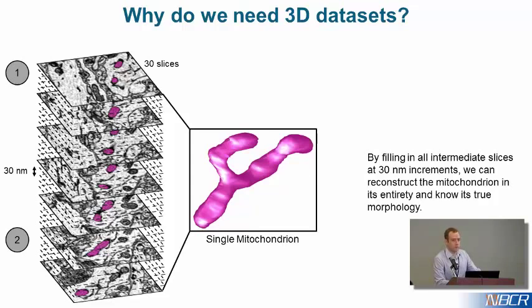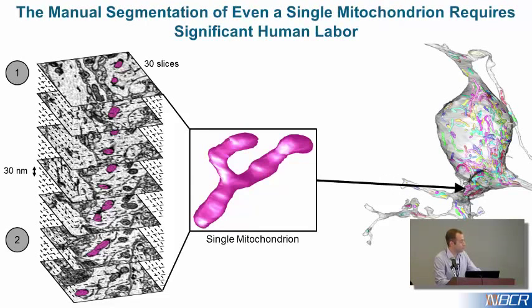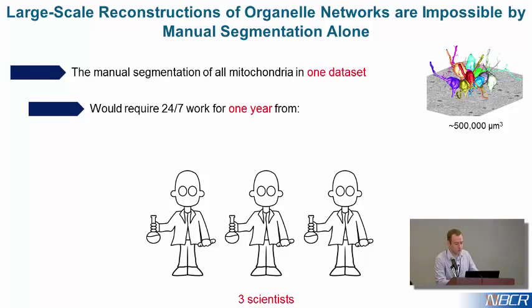Of course, as you saw before, that mitochondrion is only one out of hundreds or thousands in the data set in that single cell. So you can imagine already how long it would take to sit there just on that, however many slices that is, and trace the cross-sections of that mitochondria fully. So I did imagine how long that would take because I didn't want to spend all my time doing this. So I did some back-of-the-envelope calculations on, well, how long would it take me, given my speed that I timed with a stopwatch, to reconstruct every single mitochondria in this volume, the one I showed you, the 32K by 24K by 1300 slices volume.